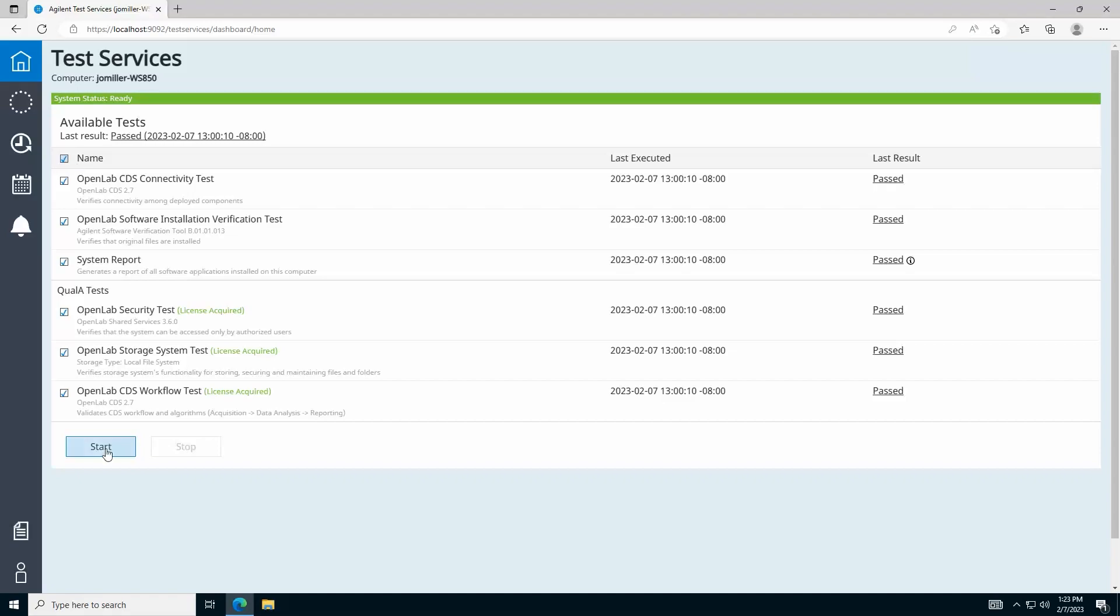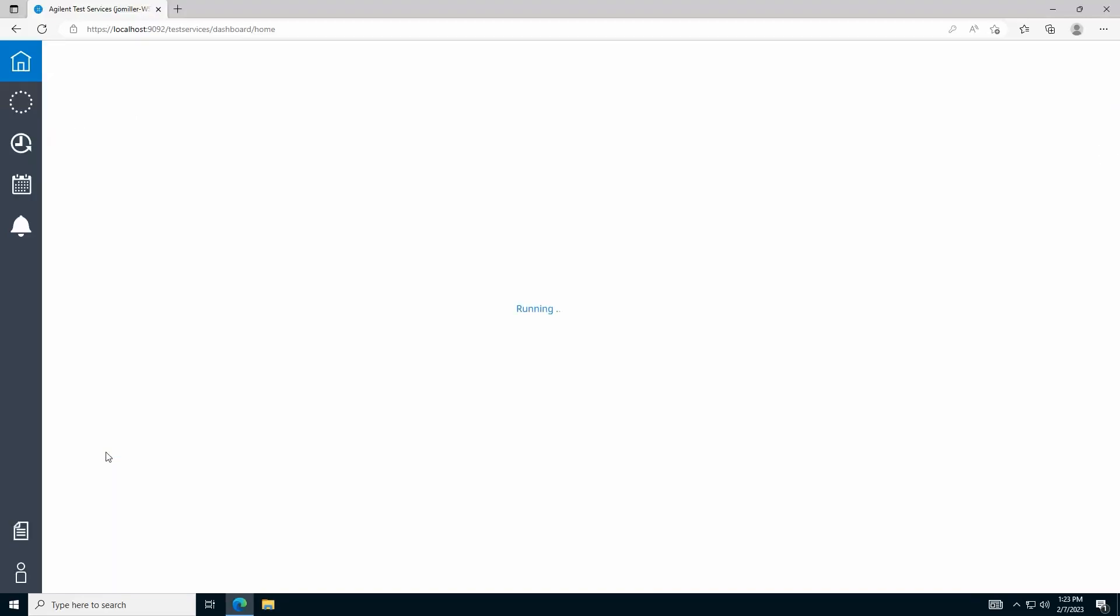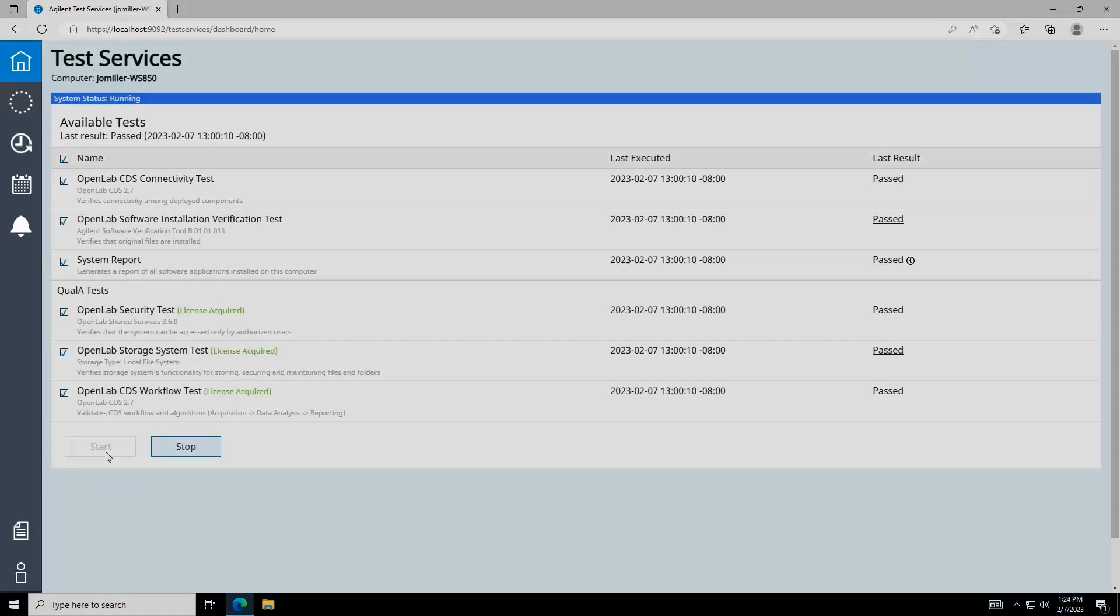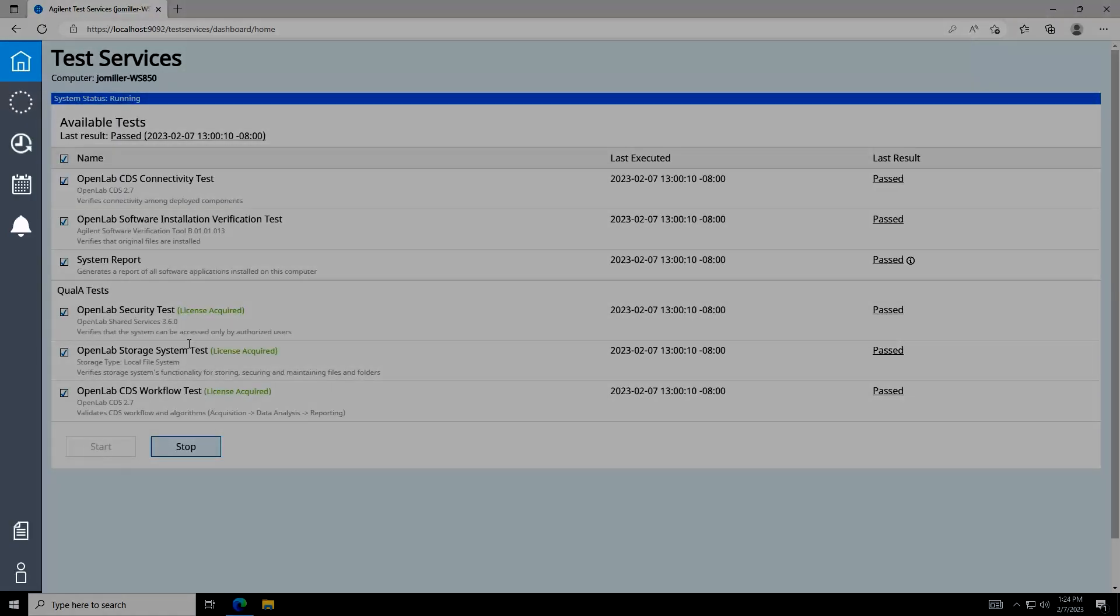Select any combination of the available tests in the list and click Start to execute them now. The navigation pane on the left will help you navigate in Test Services.